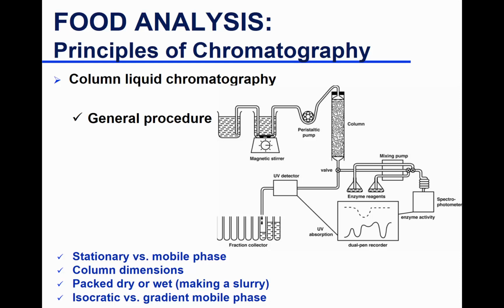Yeah. But even if you abruptly change, it takes time to get the salt out. Yeah. I'm saying salt because I'm thinking of hydrophobic interaction chromatography, but yeah.